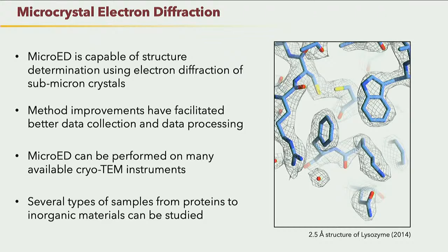So that's really exciting. You can do MicroED in a lot of commonly available instruments that many people already have, with just maybe improving the camera, for example. And now they're making dedicated electron diffraction instruments as well. So it's really an exciting time for MicroED. But don't think that just because you don't have a dedicated microscope for MicroED, you might not have something somewhere nearby that could actually do it.